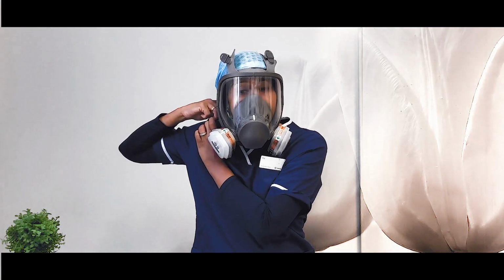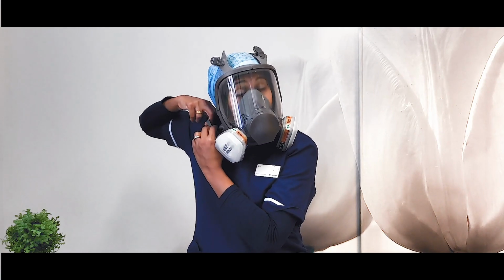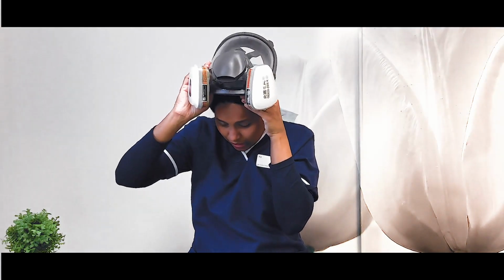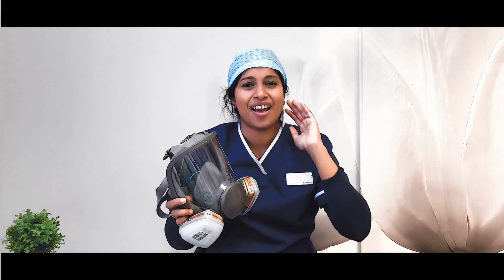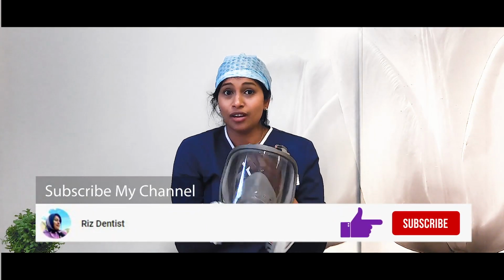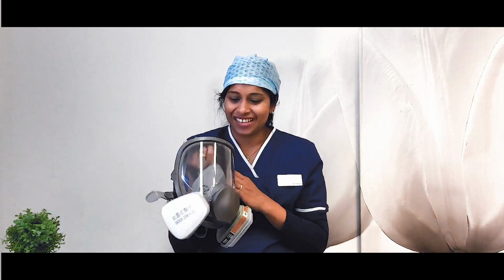These, the half face shield and the full face shield, now also come in the powered type. So I will be demonstrating the hood type powered respirator, but you also just need to know that you can have the half face shield I showed you earlier and this full face shield come with an air purifier as well, which really makes these quite good and very comfortable to use. But the only problem is you can't wear loops with the full face shield, but you can with the half face shield ones. So that is a quick roundup of all the respirators for you.